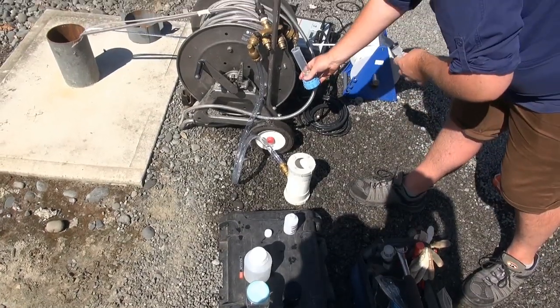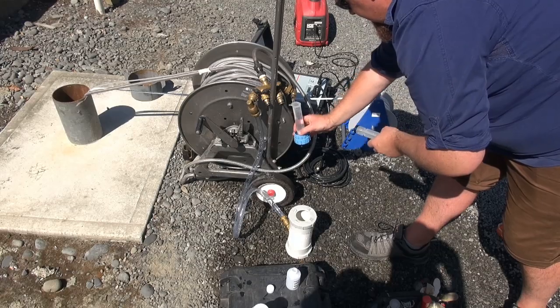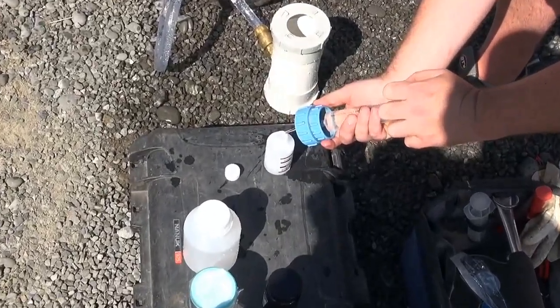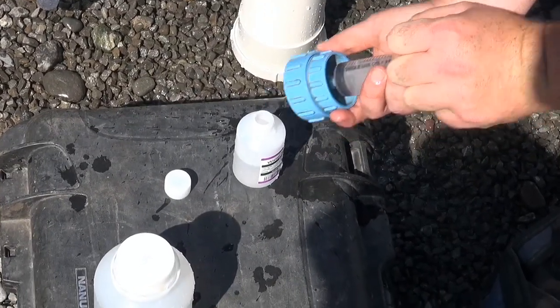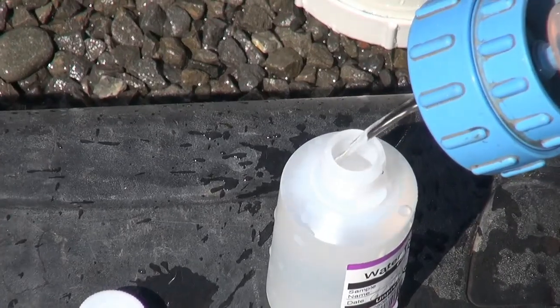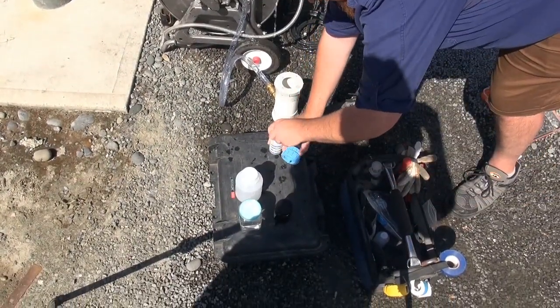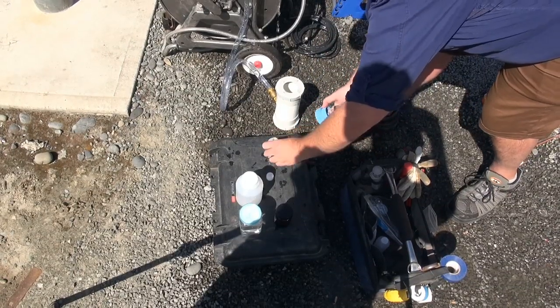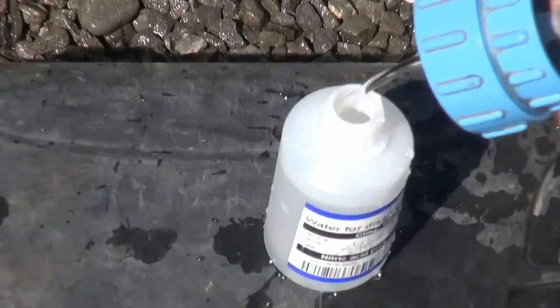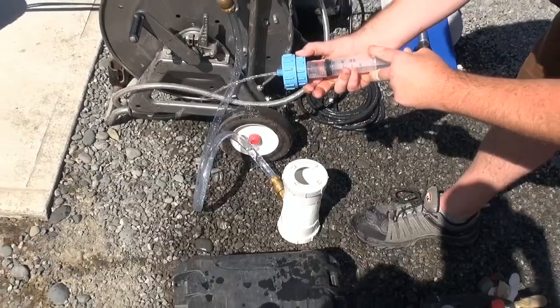These samples get filtered to remove any suspended solids that may interfere with the analysis. For the nutrients bottle, hold it at an angle so there's no drip — a nice even flow. Nutrient bottles fill right to the top; there are no preservatives so you don't have to worry about spilling. Metals bottles do have a millilitre or two of nitric acid in the bottom, so fill those up to the shoulder.